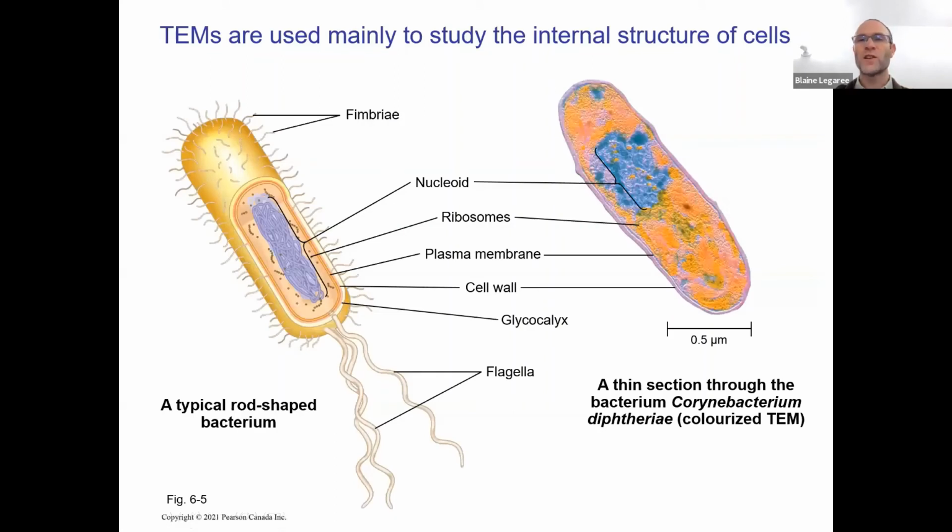Here's a professional image of E. coli, and this one has also been colorized. Oh, sorry, this isn't E. coli. This is a different bacterium called Corynebacterium diphtheriae. That's the one that causes diphtheria.